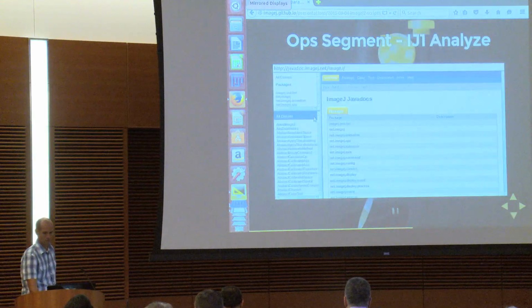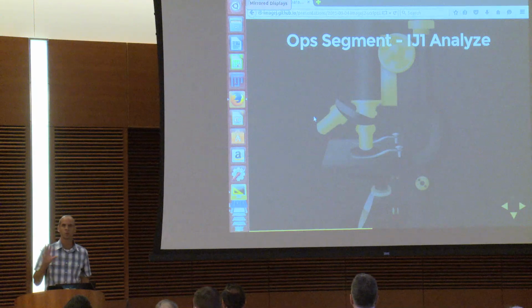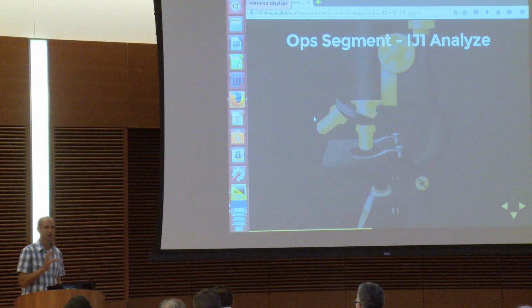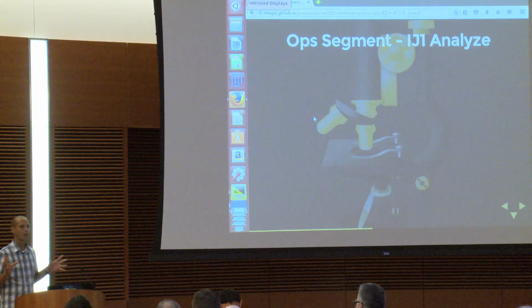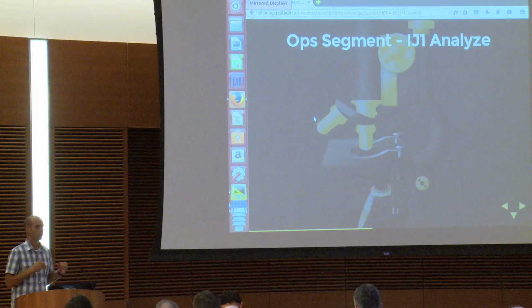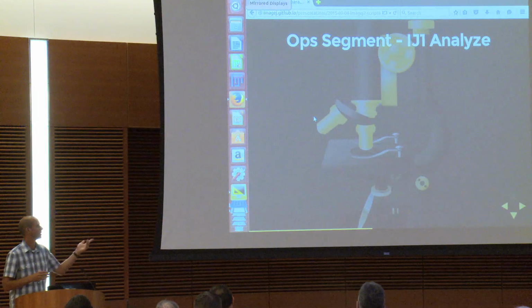Okay, so the next thing we're going to do. I think this is a really, really important example here. Maybe the most important one, because we're going to segment an image, and then we're going to use some of the classic ImageJ1 functions to display a results table. So in the future, there's going to be ops. Ops will have some more sophisticated results and ROI processing functions. So this will in the future become outdated.